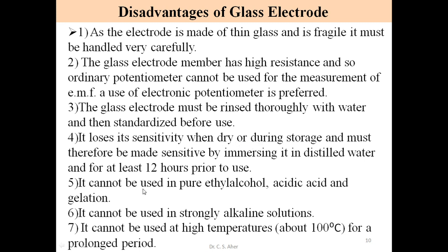Next, it cannot be used in pure ethyl alcohol, acetic acid and gelatin. It cannot be used in strongly alkaline solution.